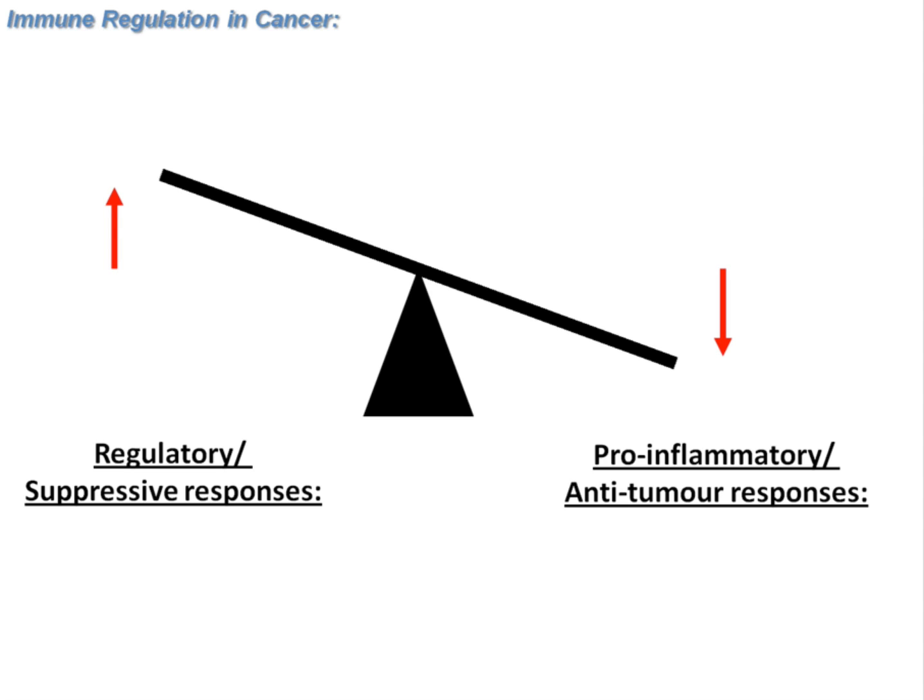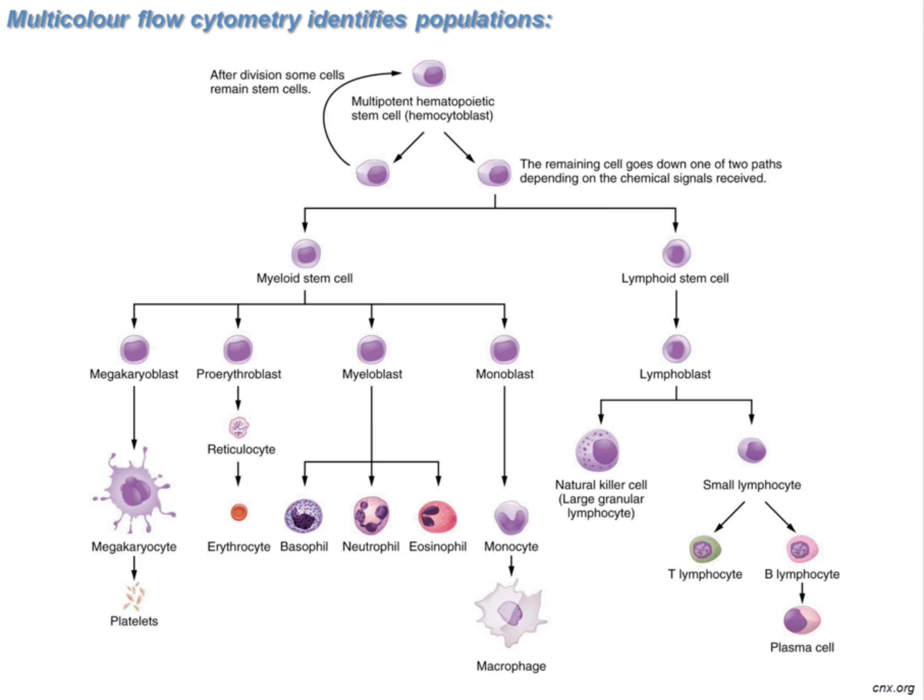So a lot of the cells that we study for this, and the output is by cytokines. Firstly, we need to think about multicolor flow cytometry, really to identify the cells involved. Of all the immune cells involved, our particular group are interested principally down here in the T cell. Within all the immune cells, this is a small subset. So that's our T cells.